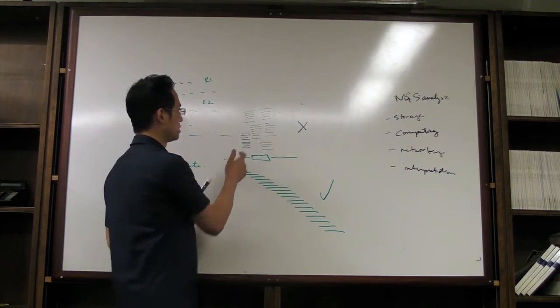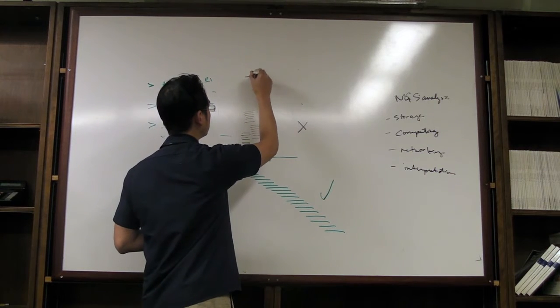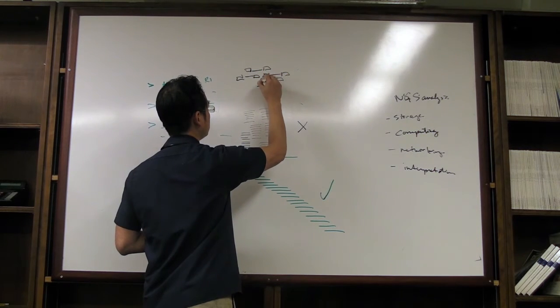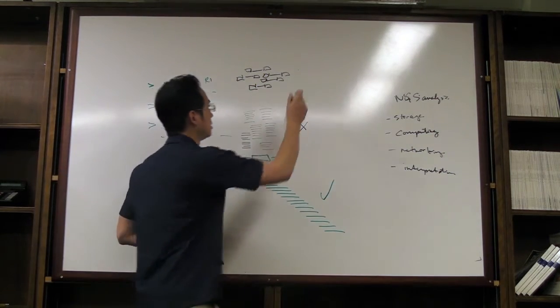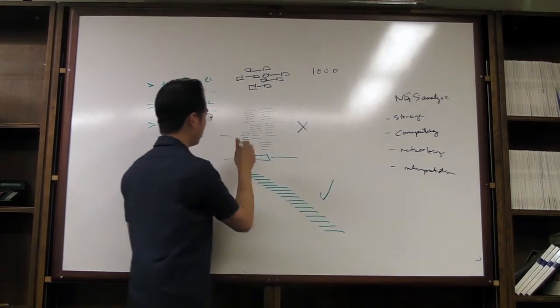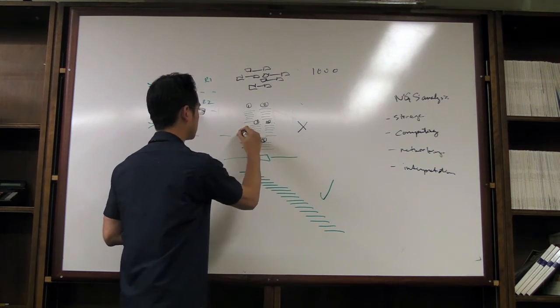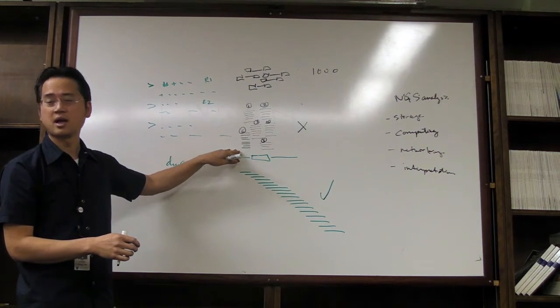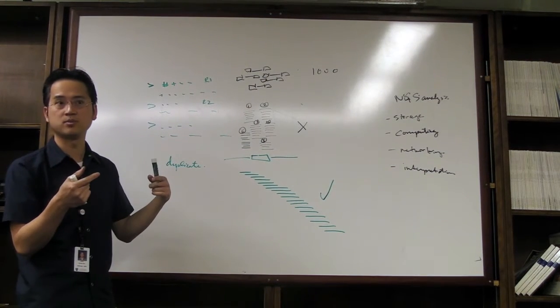So if you have something like this, it might mean that you were only targeting a small subset of your alleles. So let's say you start out with 1,000 alleles here. But in the end, you only get 1, 2, 3, 4, 5, 6. It looks like you only targeted 6 unique alleles. And these alleles, during the final PCR step, were amplified because you used PCR.